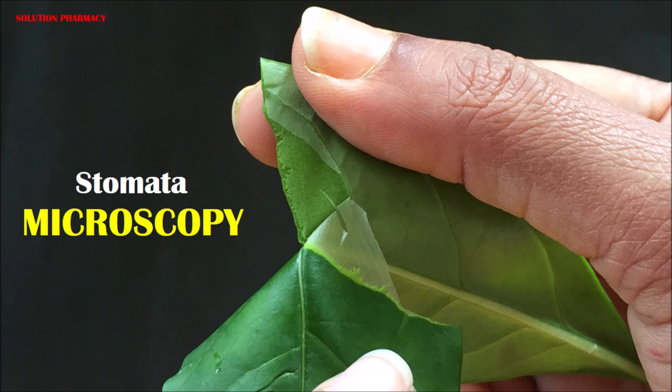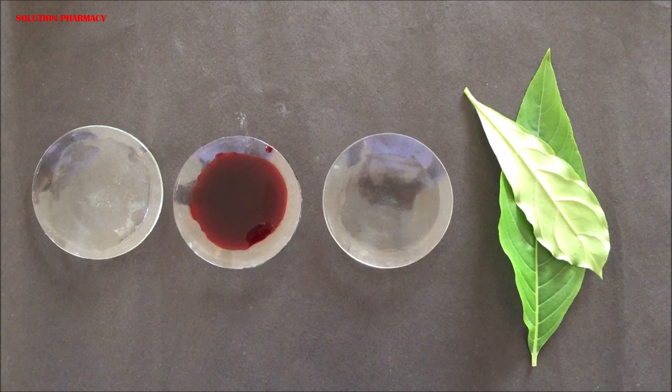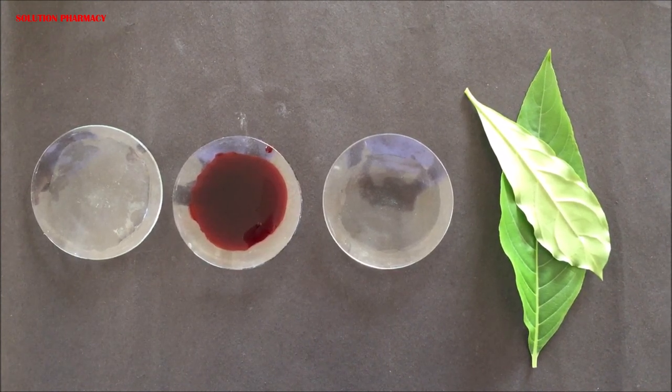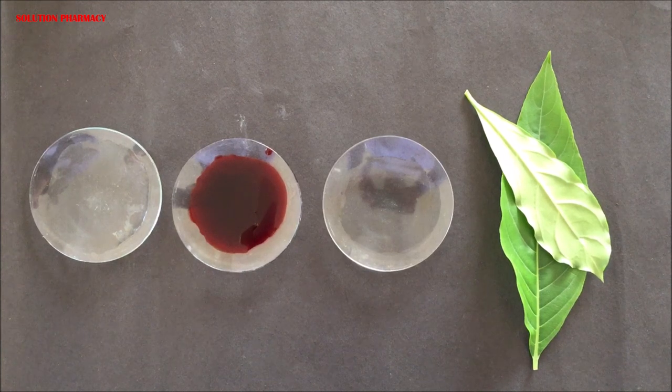Hello friends, welcome to the channel Solution. Today we are going to show you how to prepare a temporary slide of stomata for microscopic study. We have taken leaves already cleaned with water. In the first watch glass we have plain water, in the second dilute saffronine solution, and in the third plain water again. We have taken a serpaganda leaf sample.